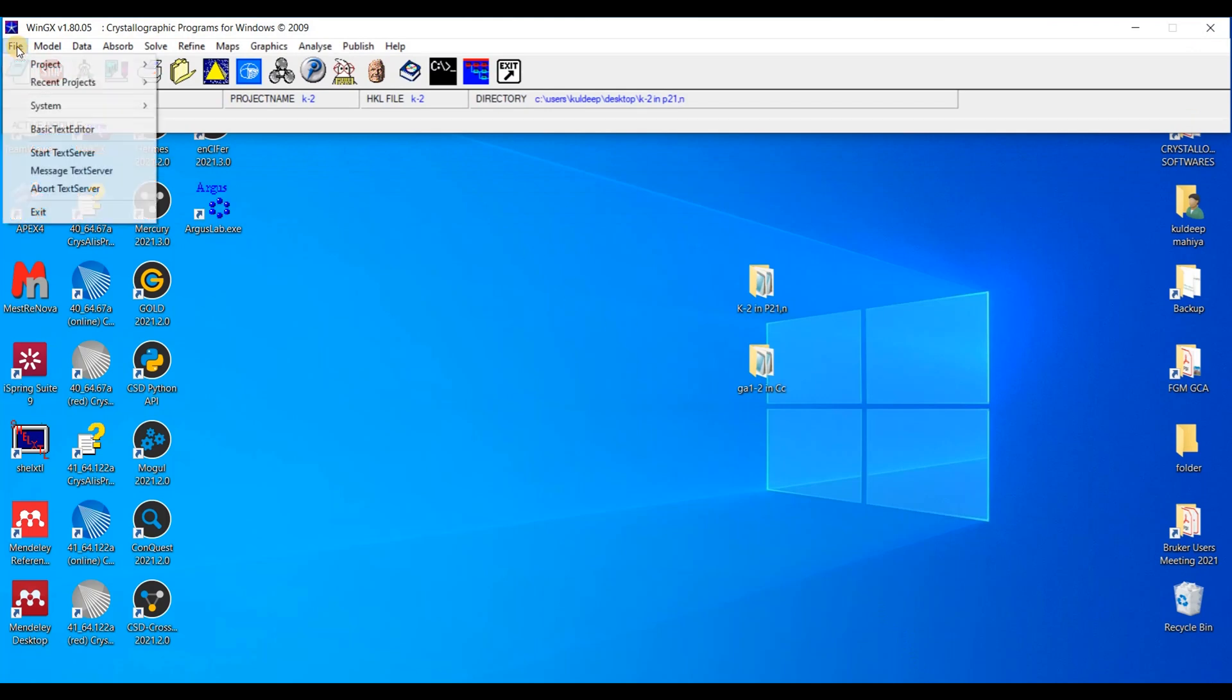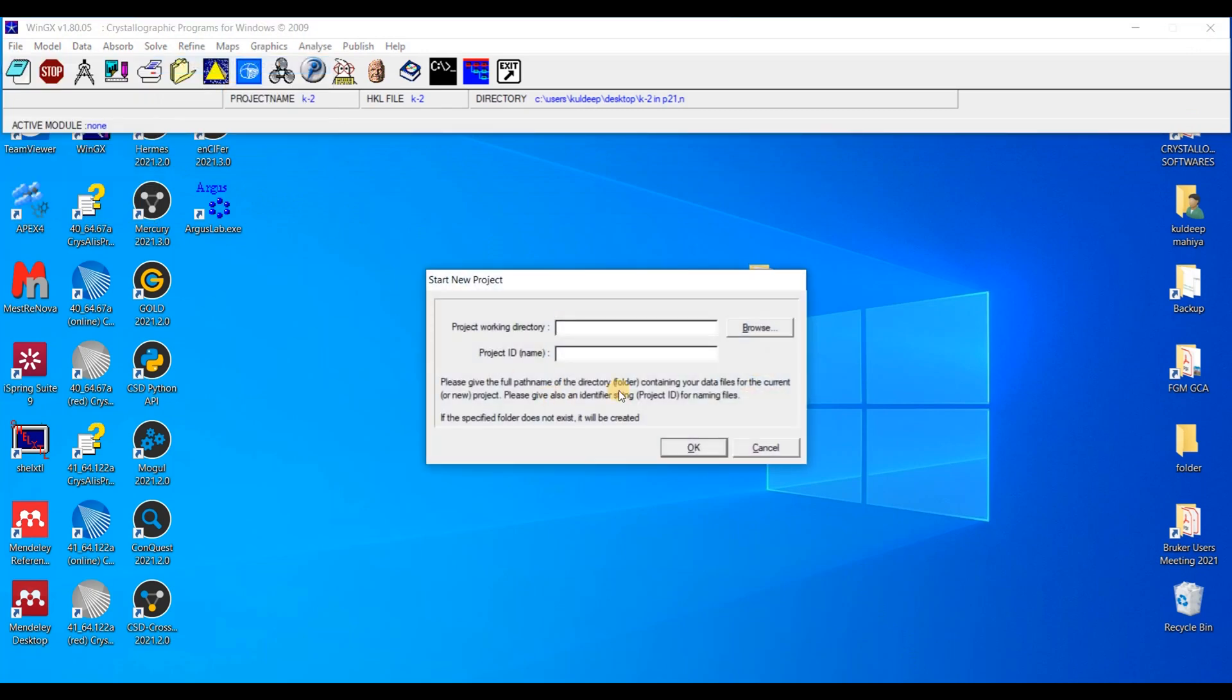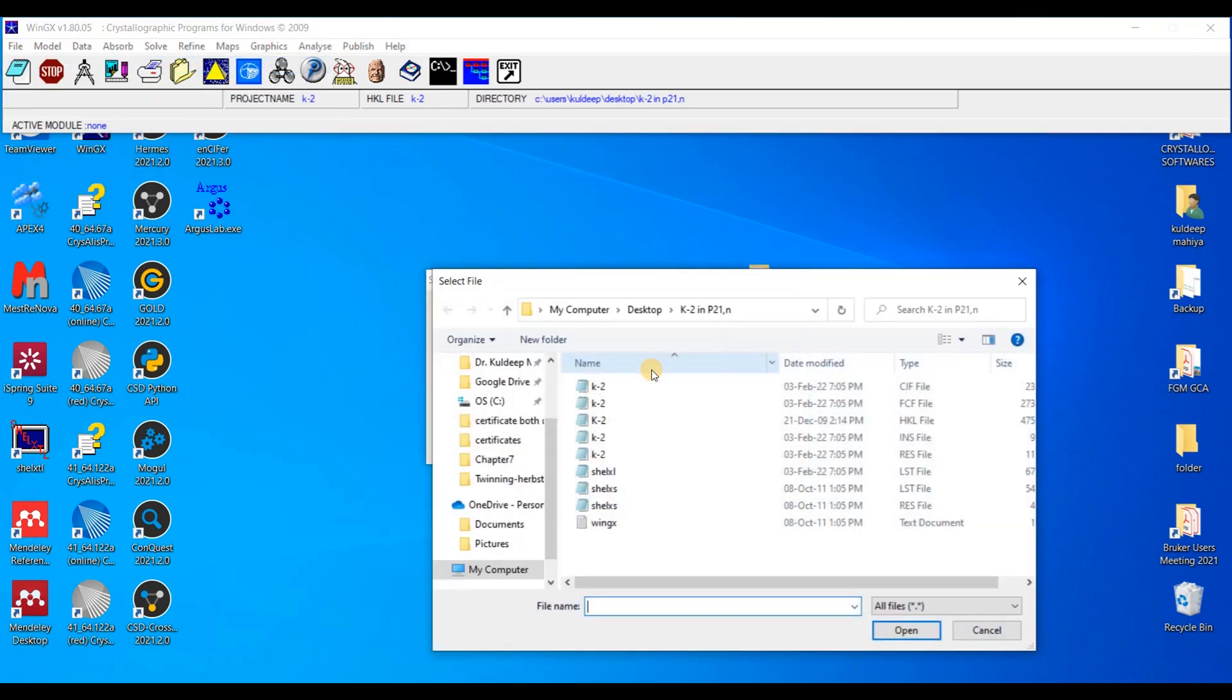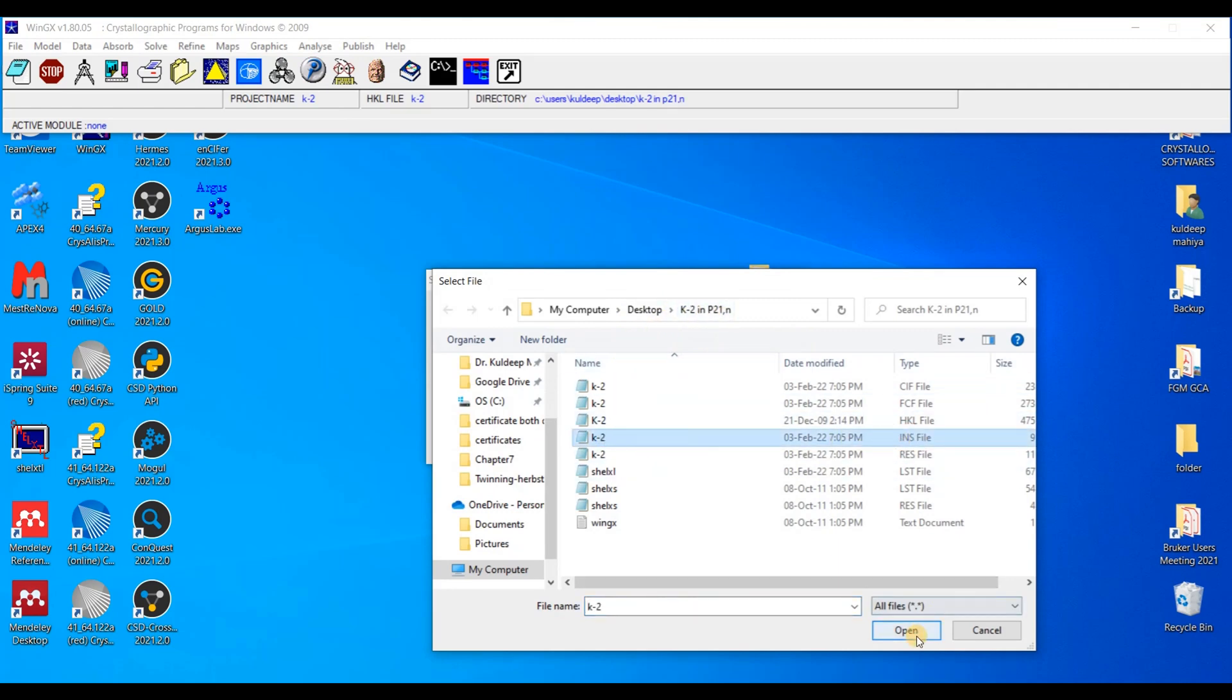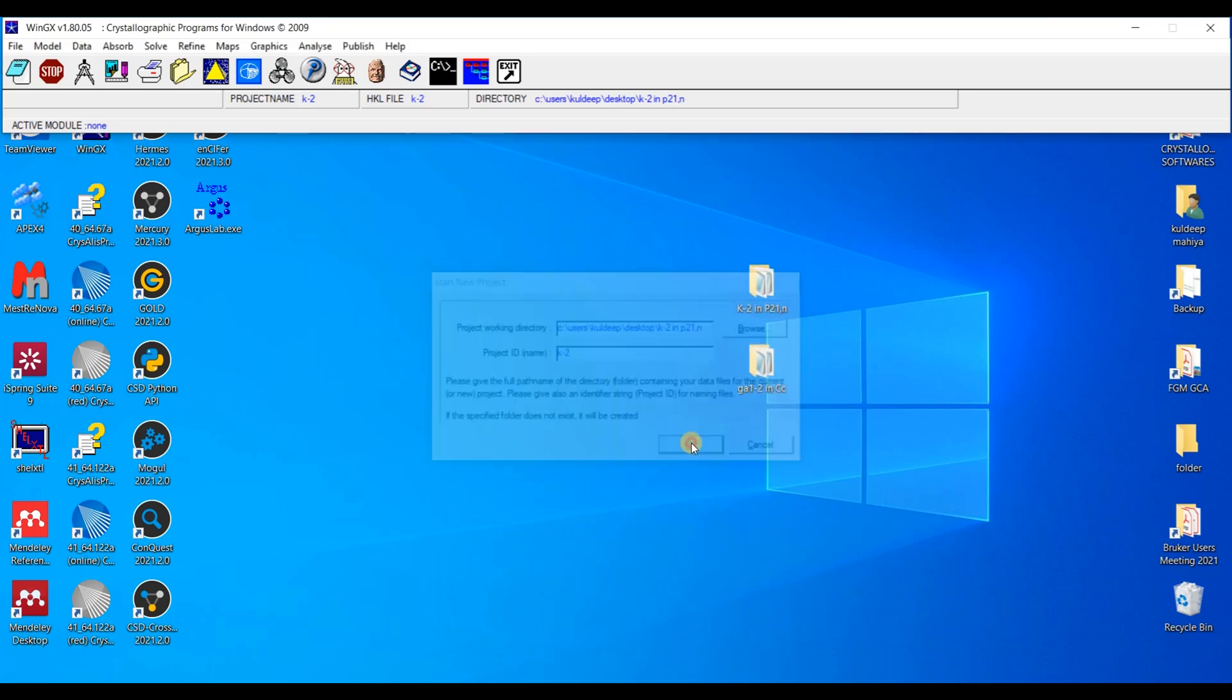Going to File, Project, Start new project. And I am taking the INS file for this purpose. Now I am going to open this and OK.